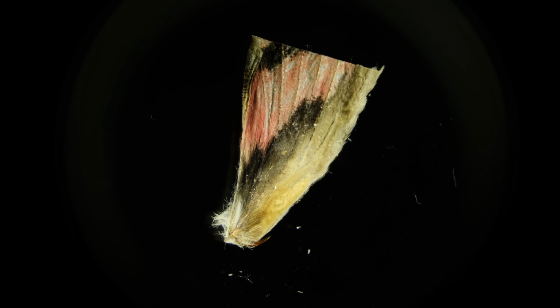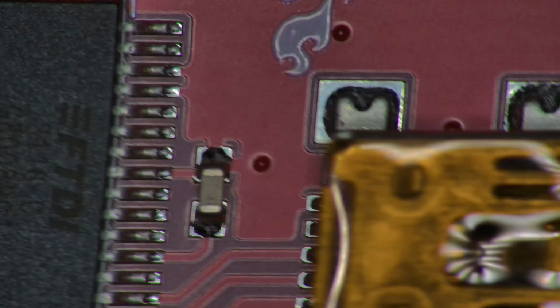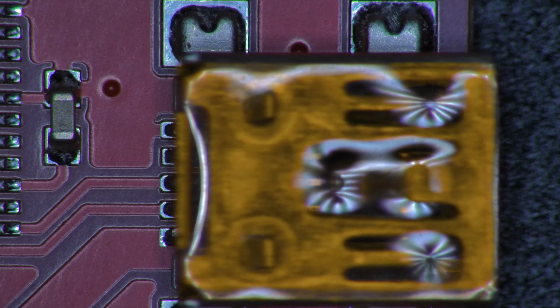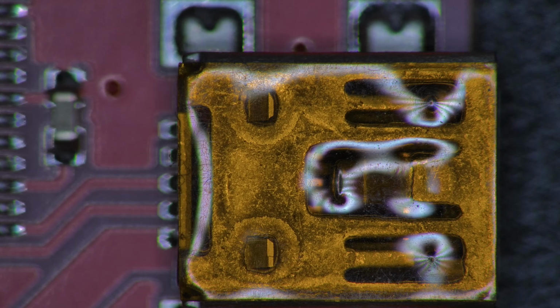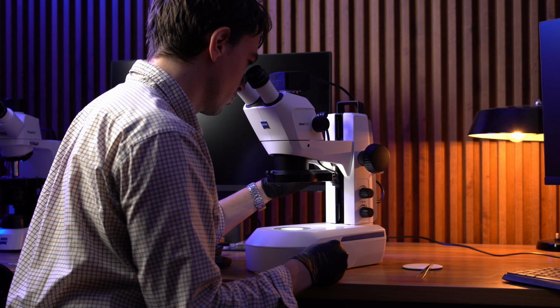With a stereo microscope, you can easily observe insects and other 3D objects thanks to its large depth of field. You can solder, assemble things, inspect basically anything. No sample preparation required at all, just put the object under the microscope and look. Super simple. But keep expectations realistic. You won't be able to see single-cell organisms, there just isn't enough magnification. Real resolution is about 10 microns. Butterfly wing scales are a great example of what and how you can see.